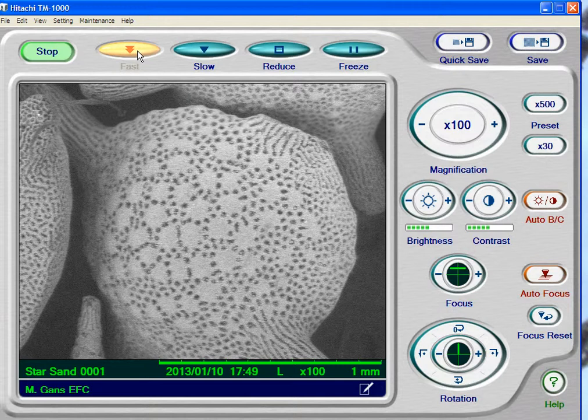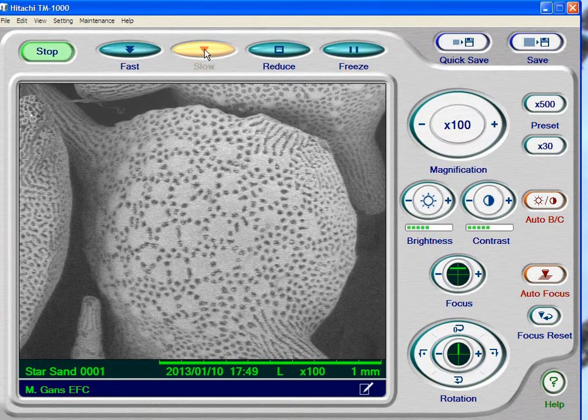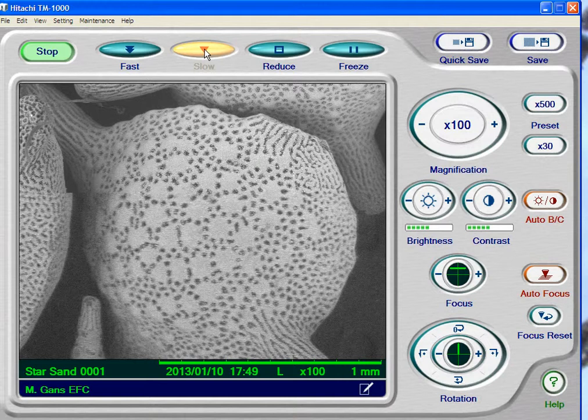So when you're moving the specimen around, you want to go to fast scan. When you're really trying to see the quality, you want to go to slow scan.